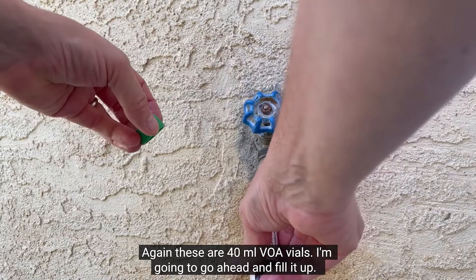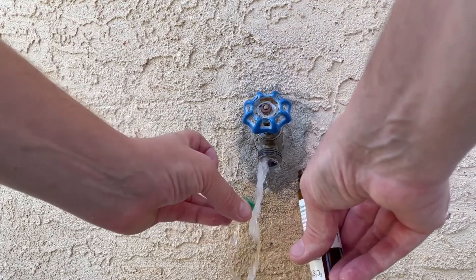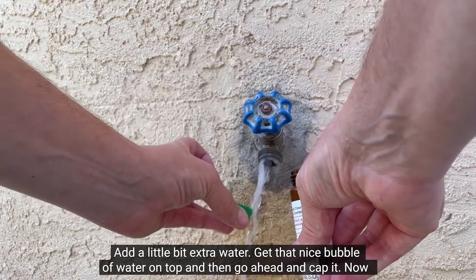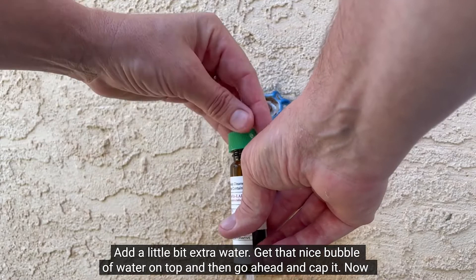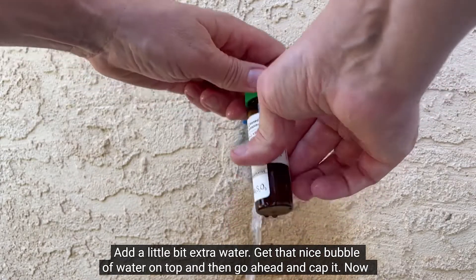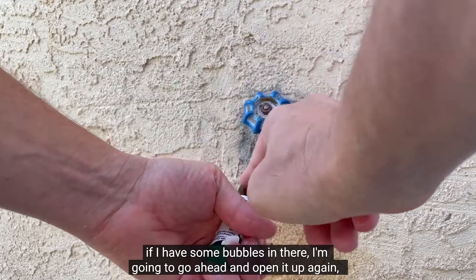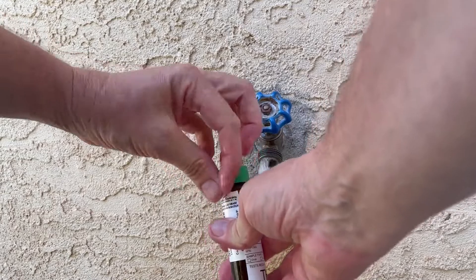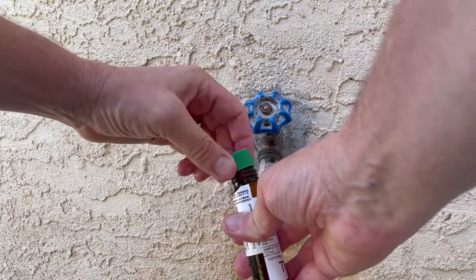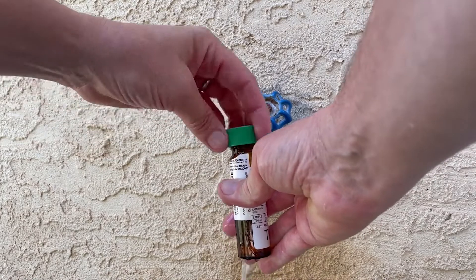I'm going to go ahead and fill it up, add a little bit of extra water, get that nice bubble of water on top, and then cap it. If I have some bubbles in there, I'm going to go ahead and open it up again, add a little bit more water, and then recap it.